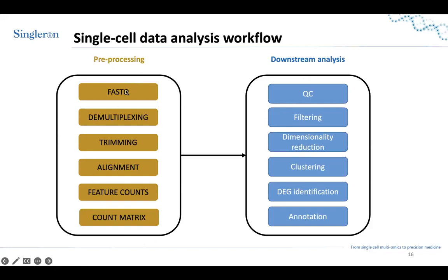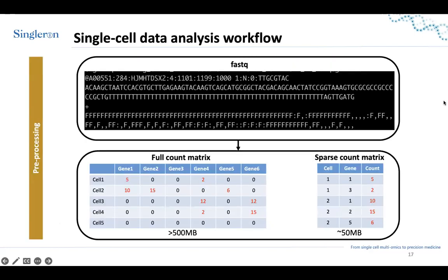We just prepare the field, prepare the data, so that we are ready to analyze in the downstream analysis. Two main workflows, and of course the tools that are used for these different parts are also different. So that's why I needed to talk about these two separately.